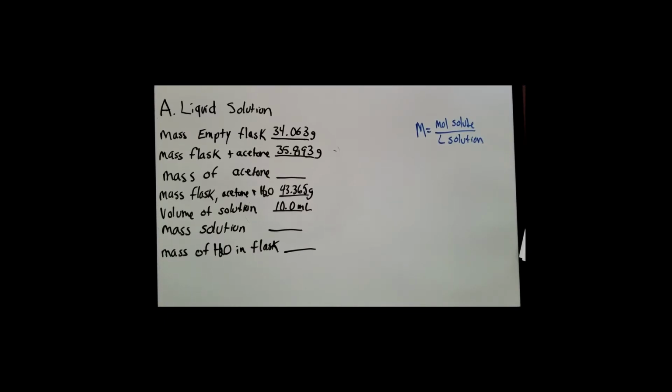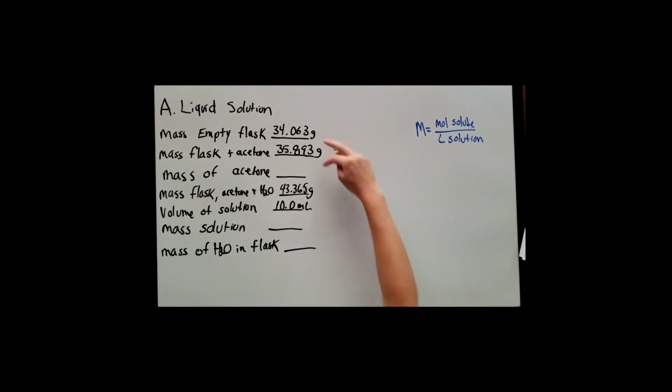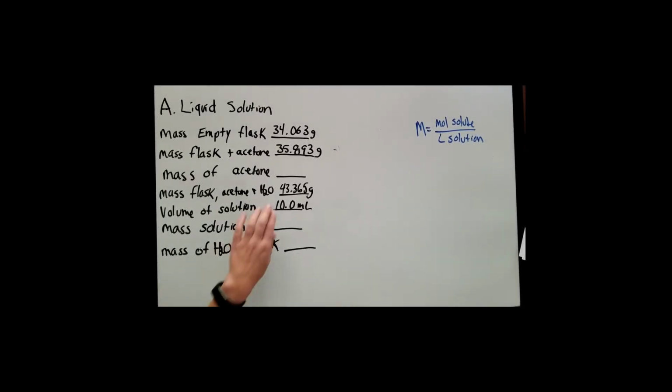We're going to look at Lab 13 today. So the Lab 13 data sheet, Making Solutions, has been provided to you in a different link. I have filled in some of the spots on your data sheet. Hopefully I have the right information this time. I'm just going to go through filling in a few of these as examples and then leave you to fill in the rest. So I'm starting with part A.